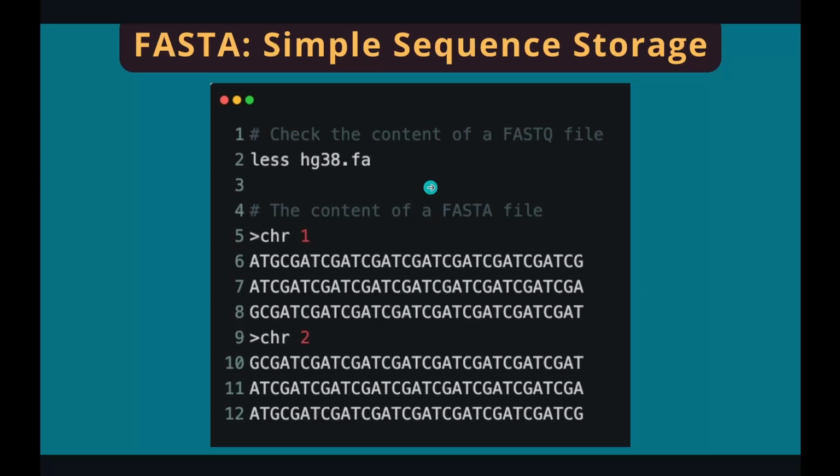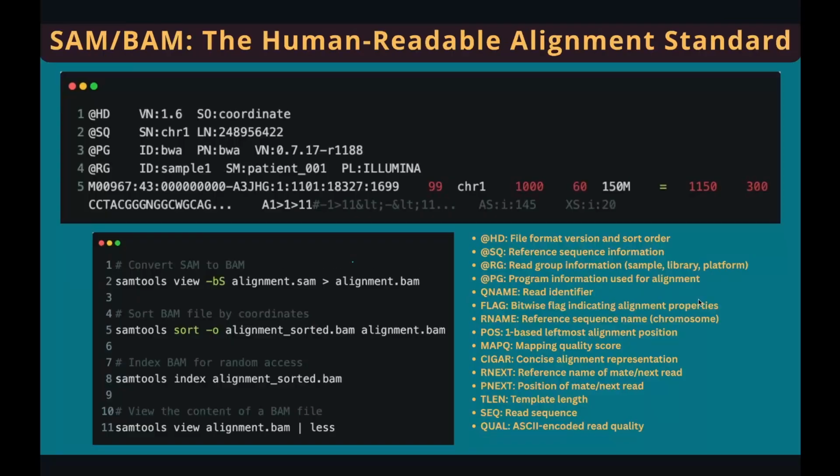Let's take a quick peek of our human genome file using less. Here is the content inside our FASTA file. The name of the sequence is represented by the greater than sign and its name. Press Q to quit once you're done peeking. Of course, we have another command called more, but trust me, less is better than more, and is more than more. Just use less. Cat will show you everything in a file, but don't use cat for human genome file because it'll just print everything forever.